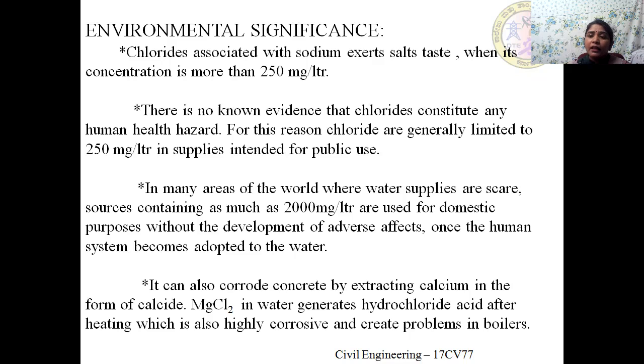But there is also evidence that when the chloride content is above 1000 mg per liter, it has not exerted any salty taste. This mainly happens when the chlorides of calcium and magnesium are present. It may not exert any salty taste, but the chloride content is higher.